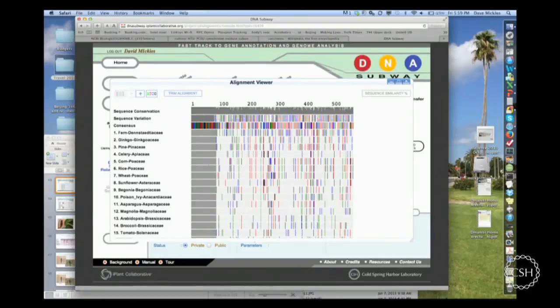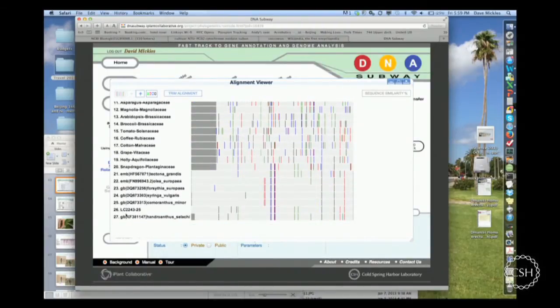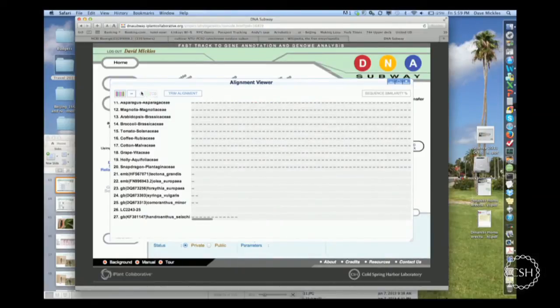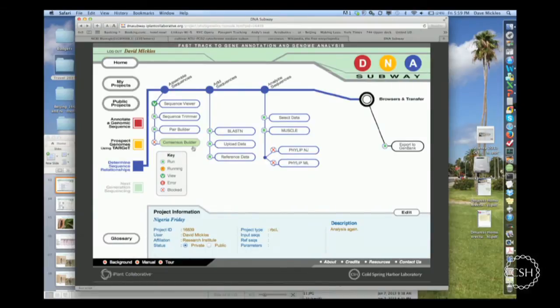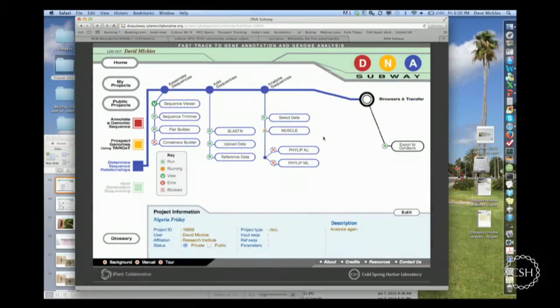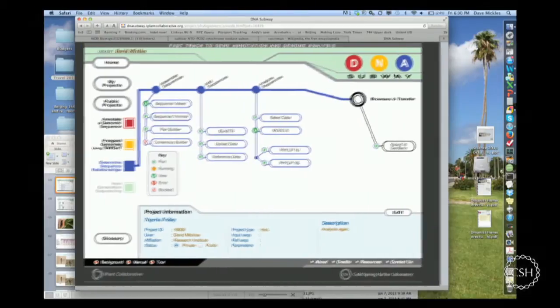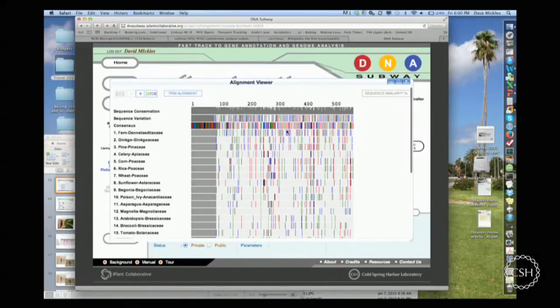And again, I'm looking for my sample here, and there it is. And what you'll see is that, let's zoom in a bit. This is to the base pair level, which is sort of overkill. Well, I've lost that screen here somewhere. Sorry, I just swiped my screen and can't find it again. Okay, but here's the analysis again.